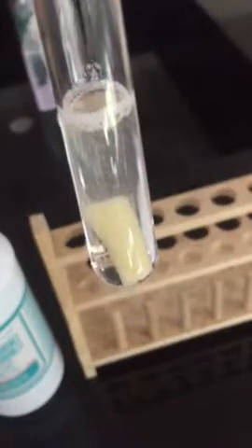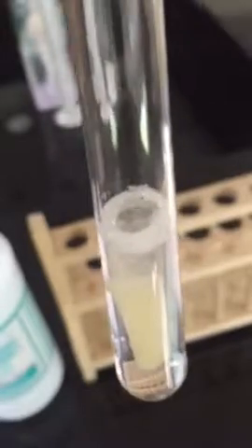If we zoom in on this, you can see some bubbling right away. So that bubbling is the production of oxygen from the breakdown of hydrogen peroxide. So H2O2 is getting broken down into water and oxygen. And so you can see that foaming on the top layer there. That's what we're going to be measuring as an indirect indicator of the rate of reaction.